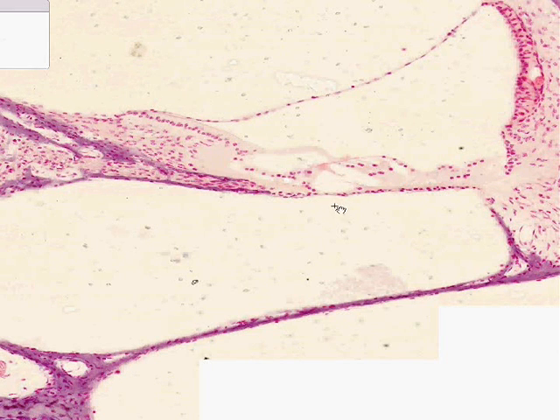So we have the scala vestibuli, vestibular membrane, scala media, organ of Corti area, basilar membrane, tectorial membrane, and then the scala tympani. The scala tympani and vestibuli being filled with perilymph, and the scala media being filled with endolymph.